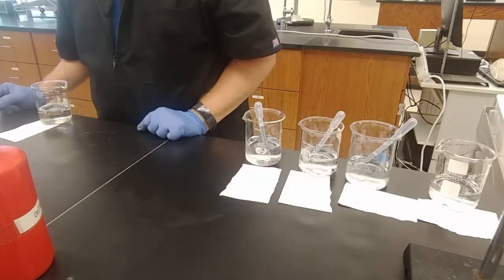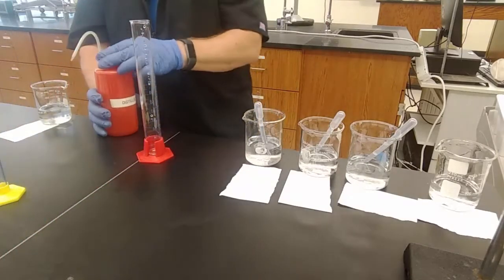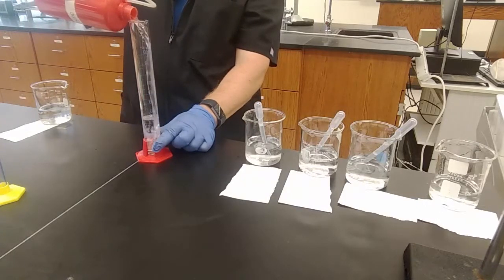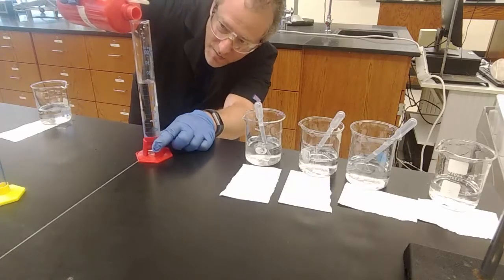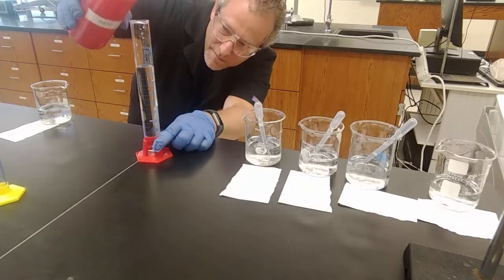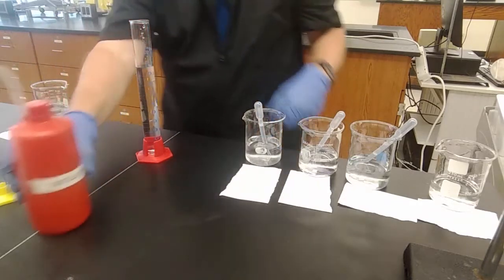So we'll add 90 milliliters of the water again. I have to refill my water here before too long. 90 milliliters of water. Beautiful. Take a touch out of there.